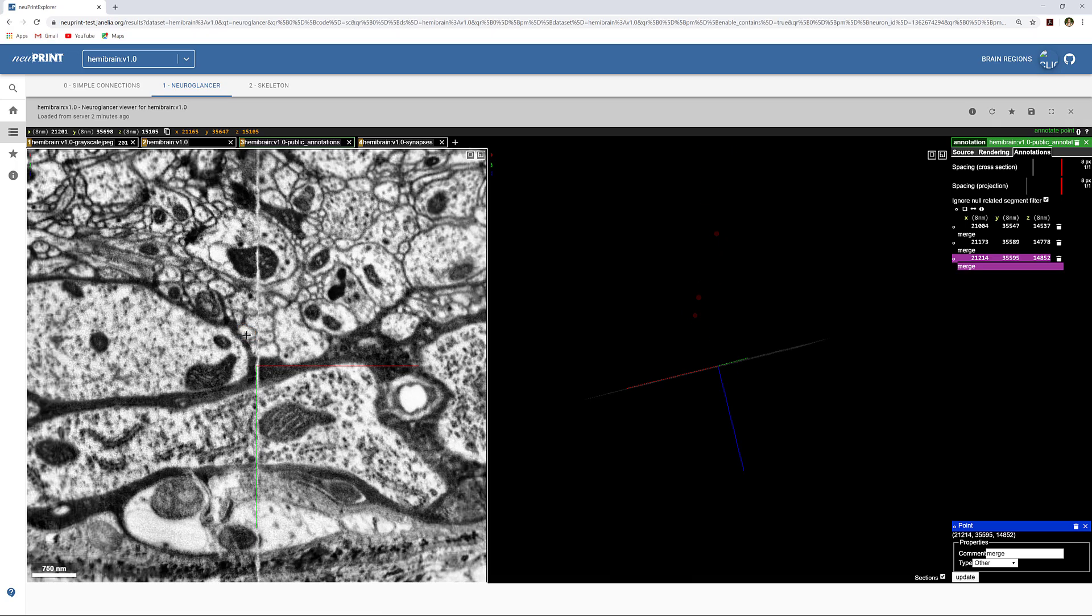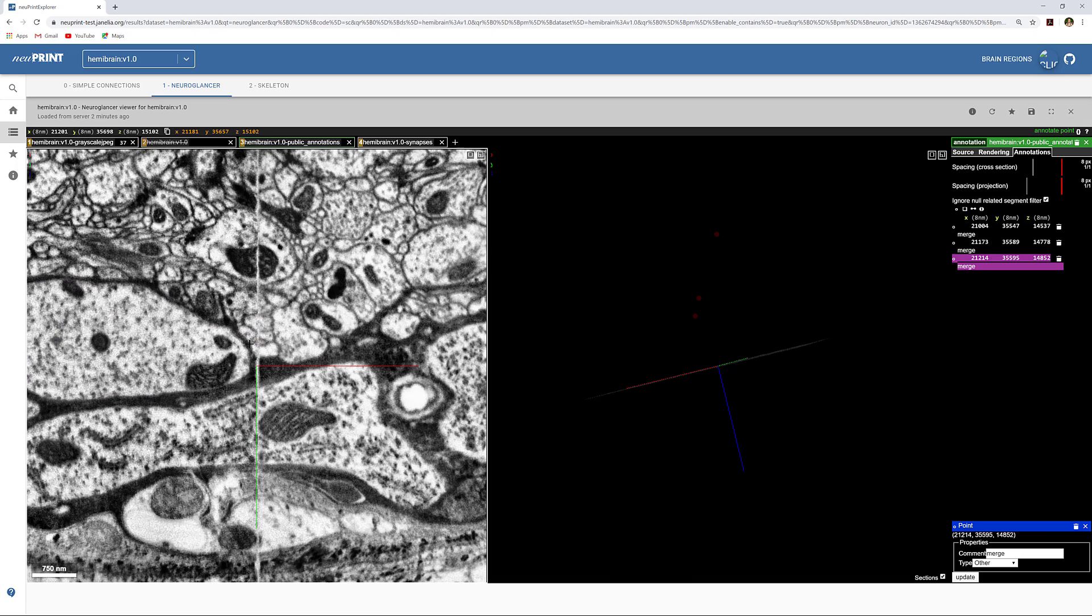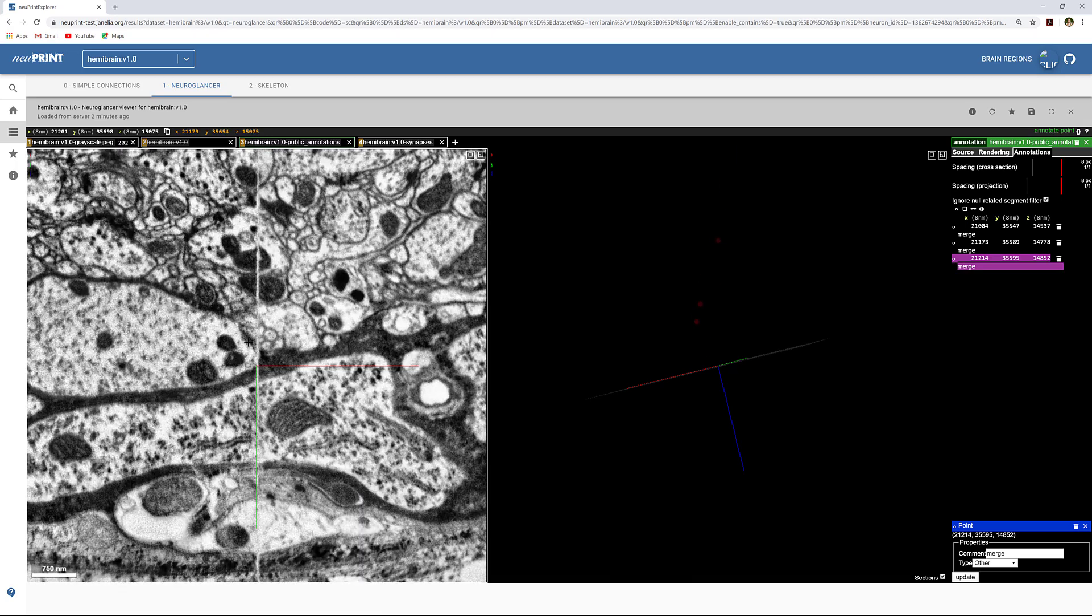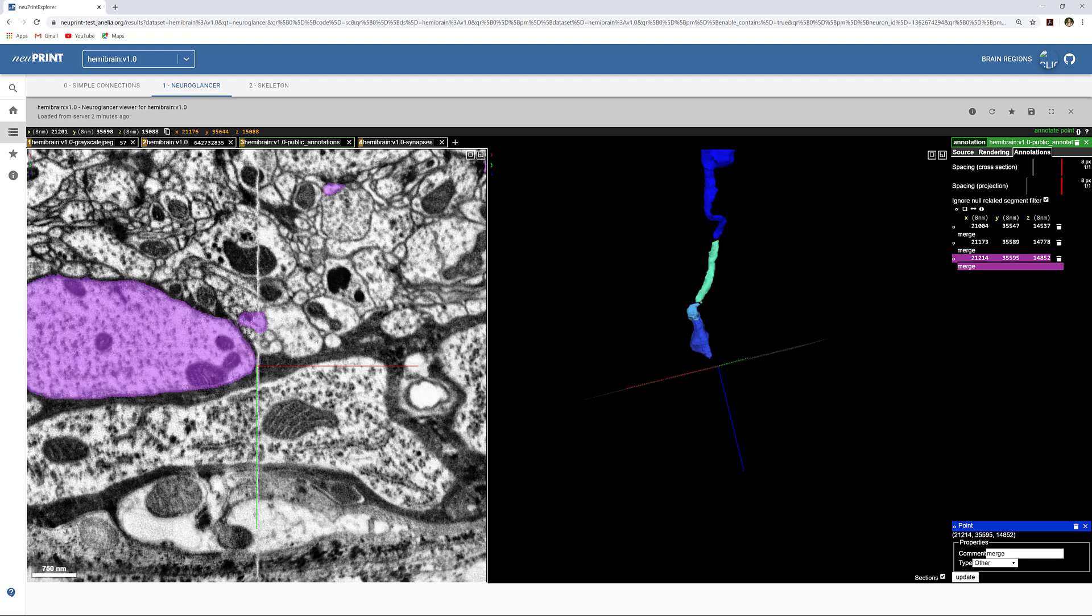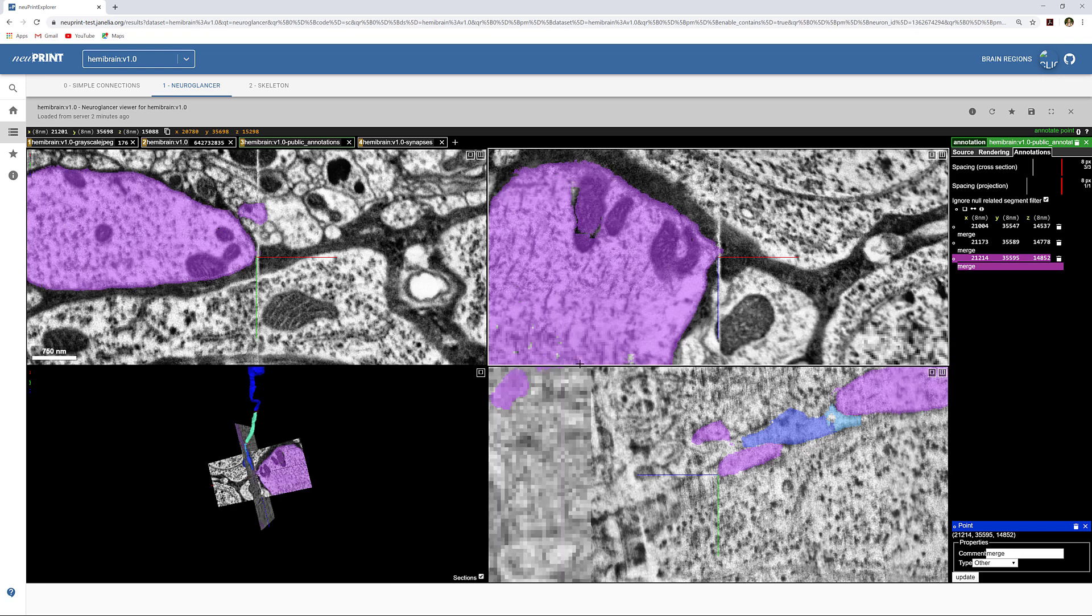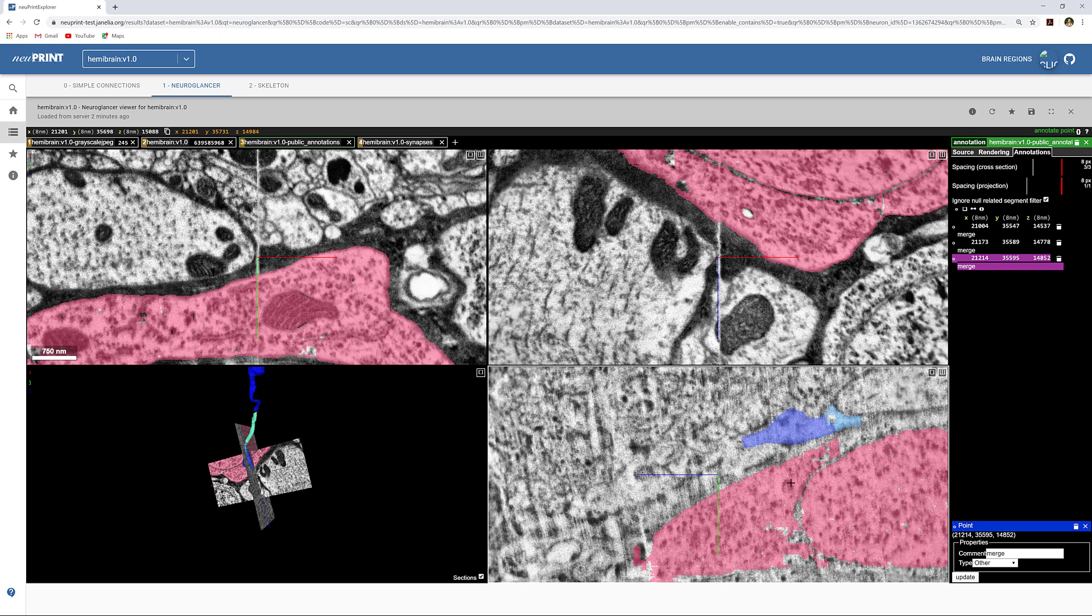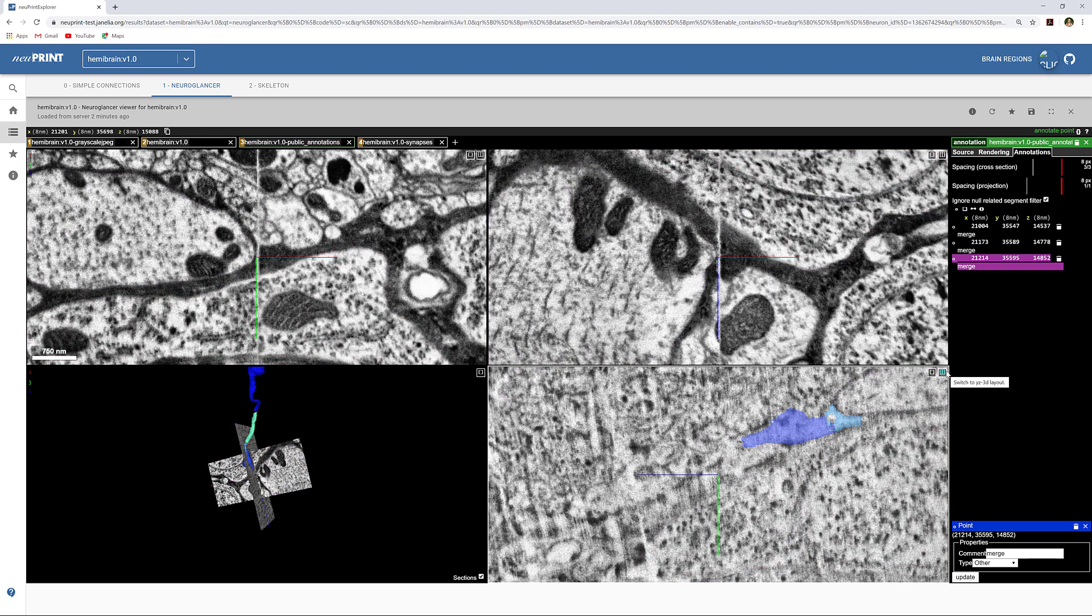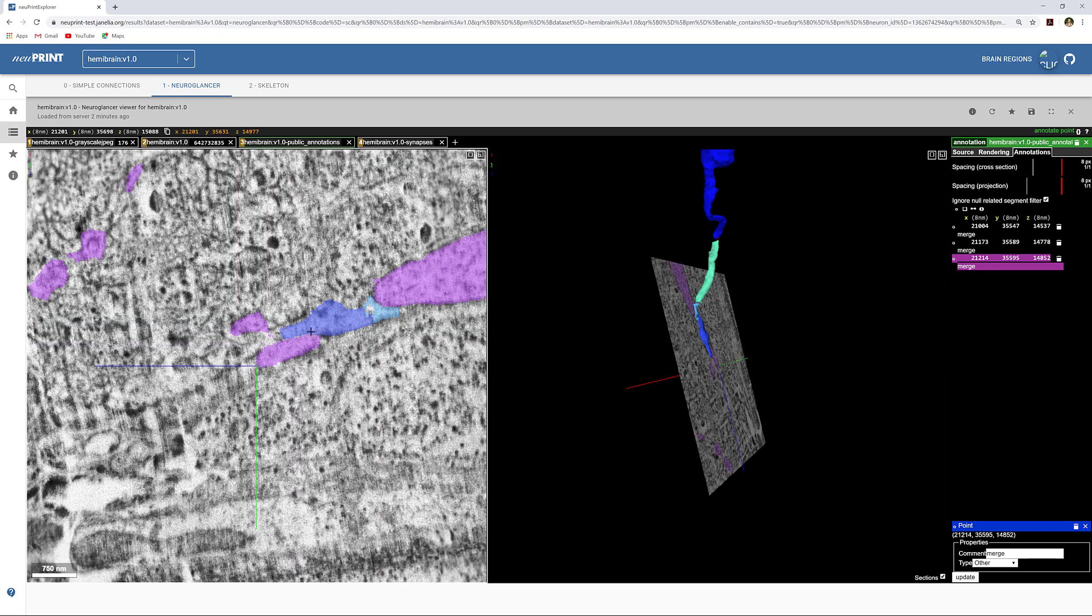This looks like it merges to the orange segmentation, but it's hard to be 100% sure. Check other angles of tricky merges such as across hot knives like this one by pressing space to see different cuts of the EM data.